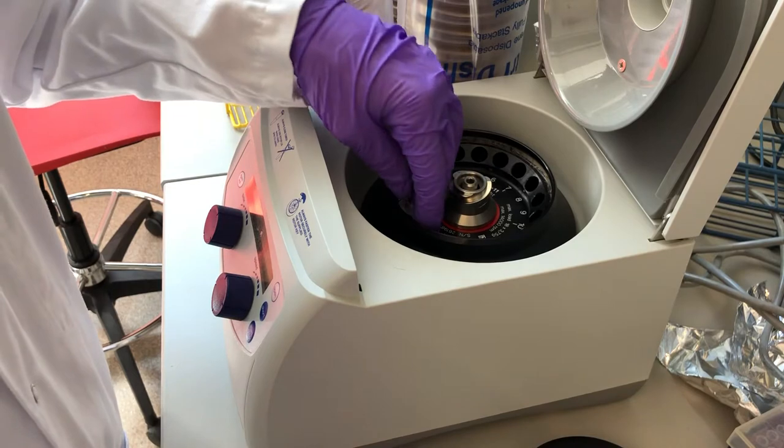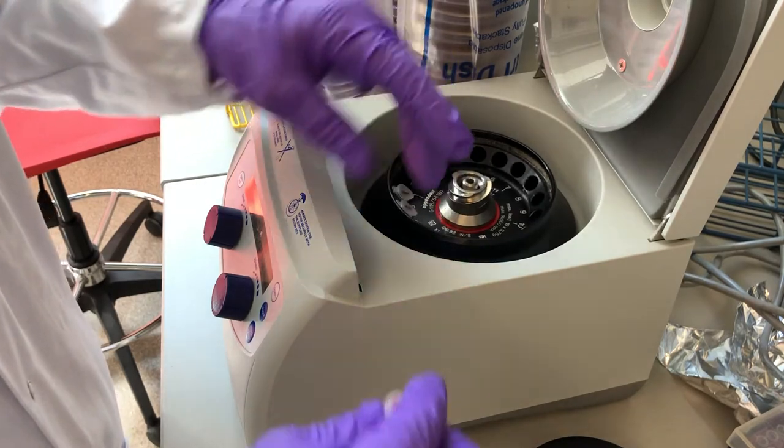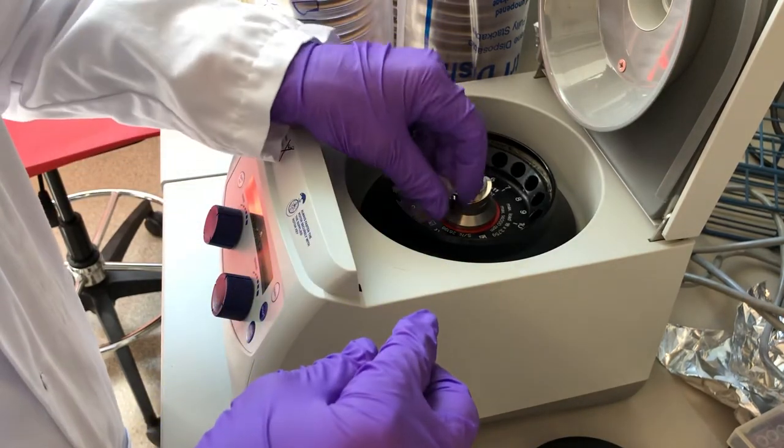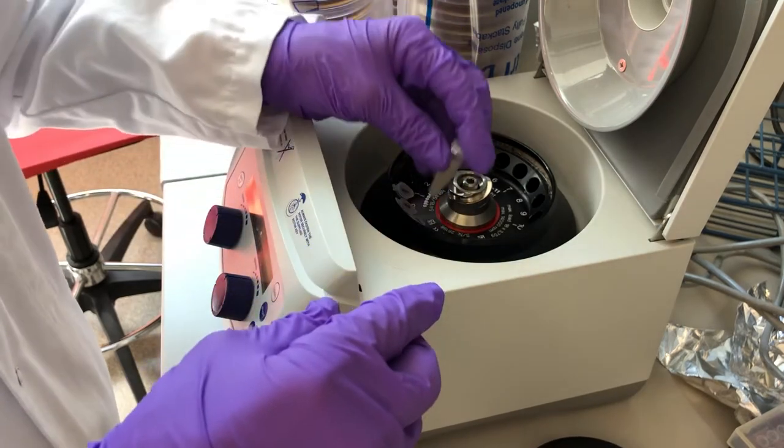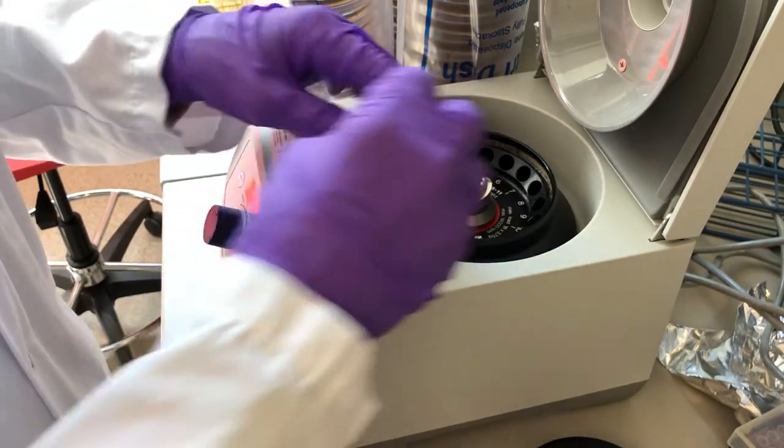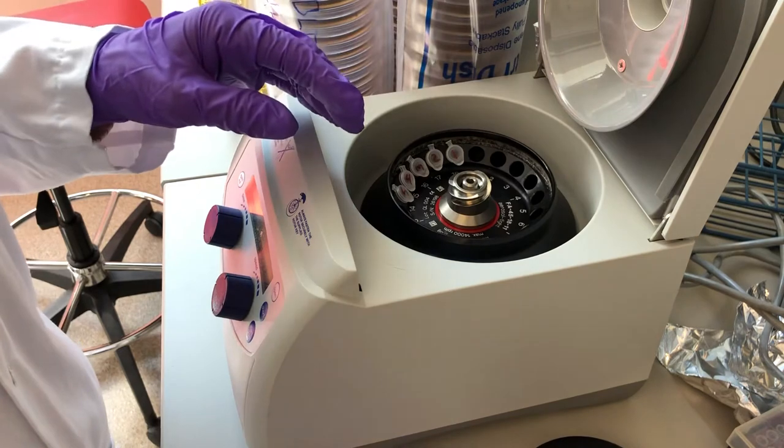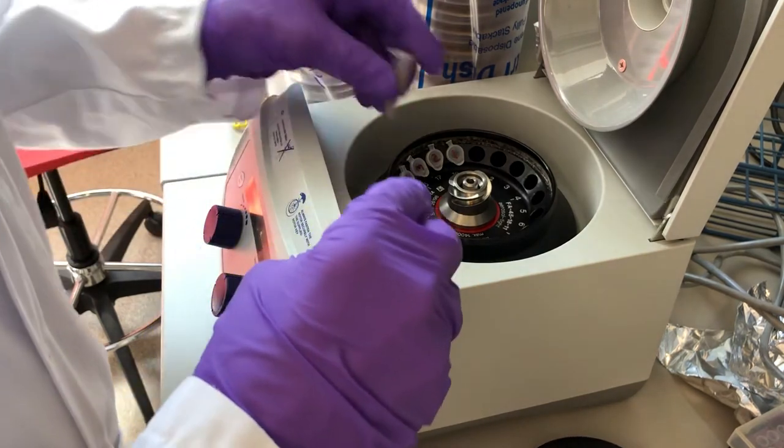I'm going to insert my tubes with the hinges of the lids facing out to the perimeter of the rotor. That way I know where the cell pellet is without having to look. Skip an empty space.